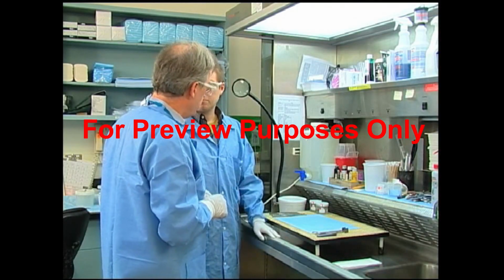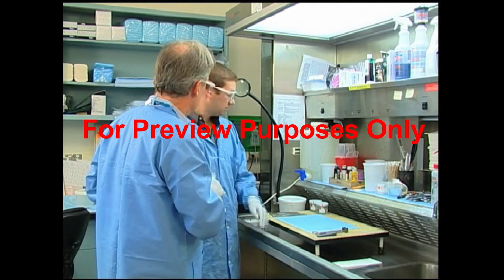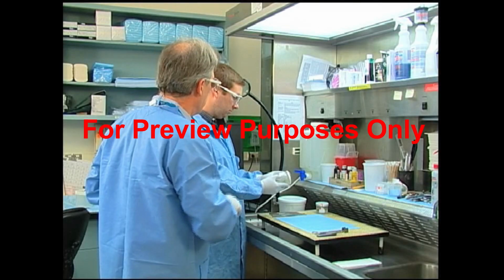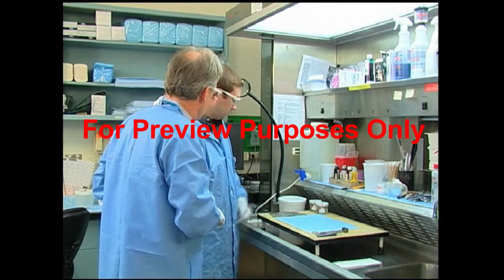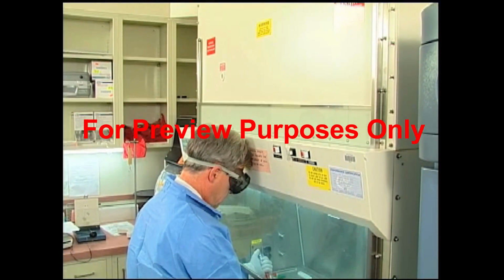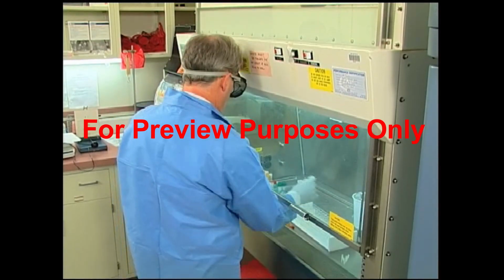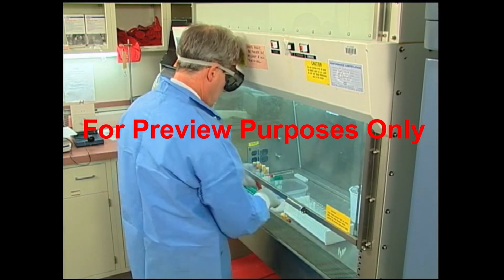Maintaining proper ventilation in your work area is one of the most important safe work practices of all. Be sure to use lab hoods and other ventilation devices to keep any formaldehyde that's in the air out of your breathing zone. Not all hoods and air evacuation devices operate the same way, so make sure you know how yours works. And be sure to follow all the rules for the safe use of these devices.